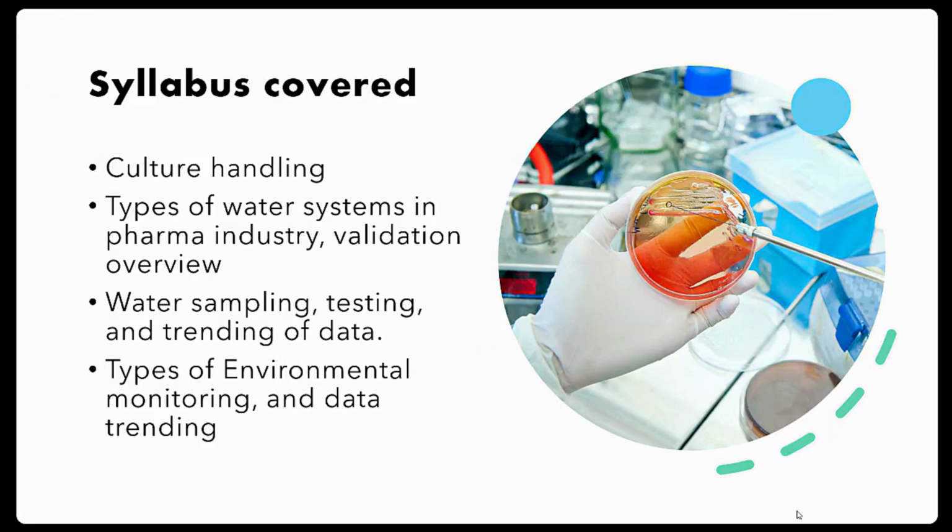Next, water sampling, testing, and trending of the data. Microbiologists should collect the samples as per the schedules. What are the precautions to be taken while sampling? How will the testing be conducted by the microbiologist? How will data be recorded? How will the results be recorded? How will the interpretation of results be recorded? We'll discuss in this chapter.